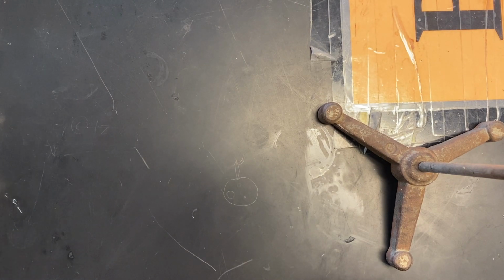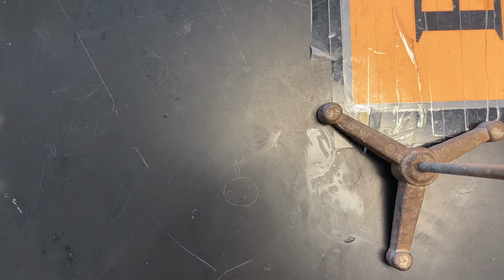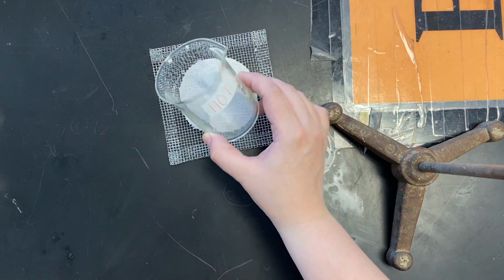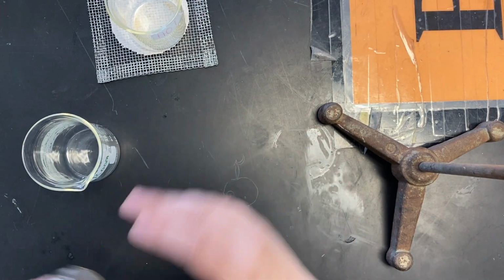So once we are getting into our lab part, you will see, at your lab station, you're going to find a beaker on a wire cooling mat that says hot, one that says room for room temperature, and one that says cold.